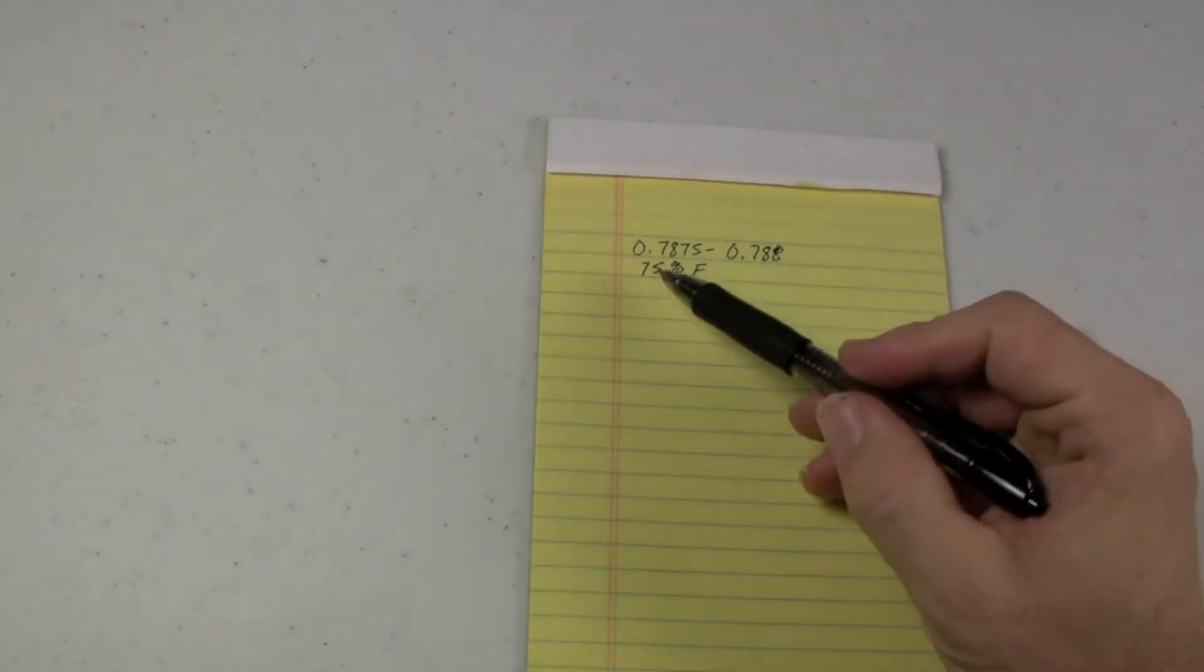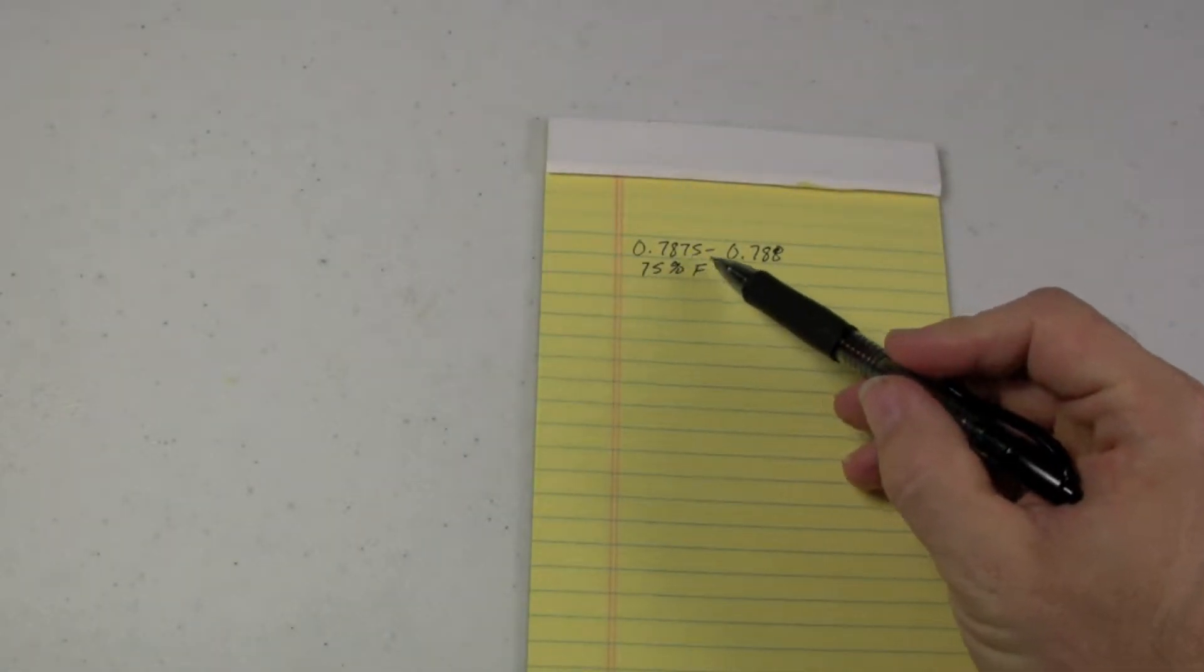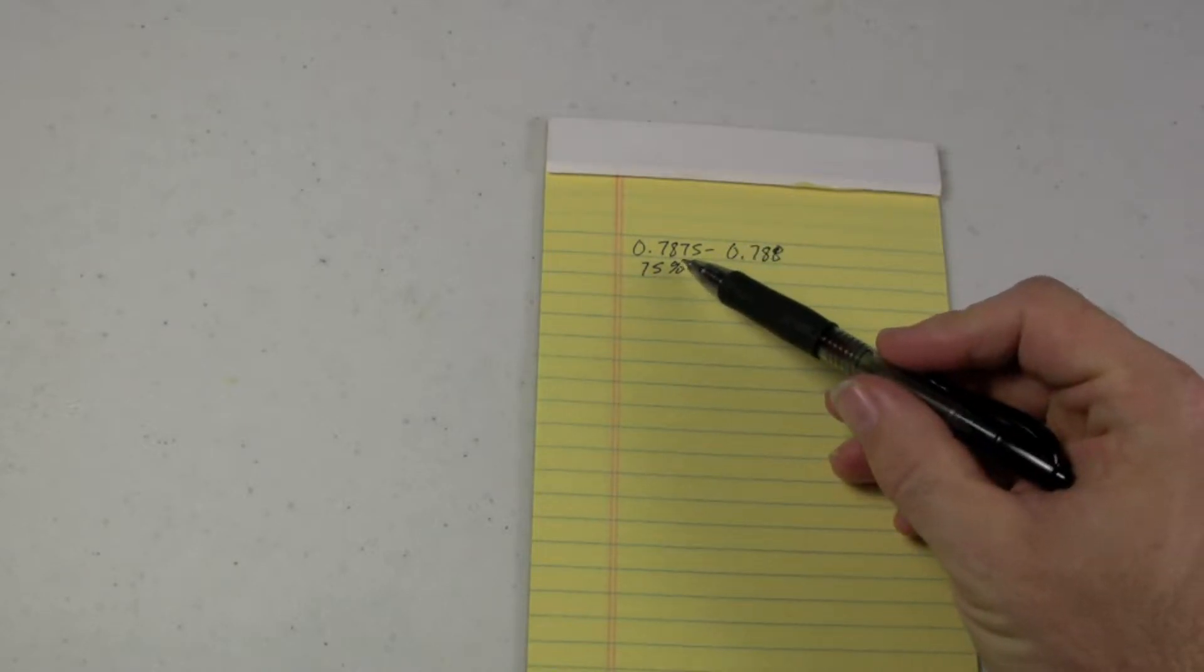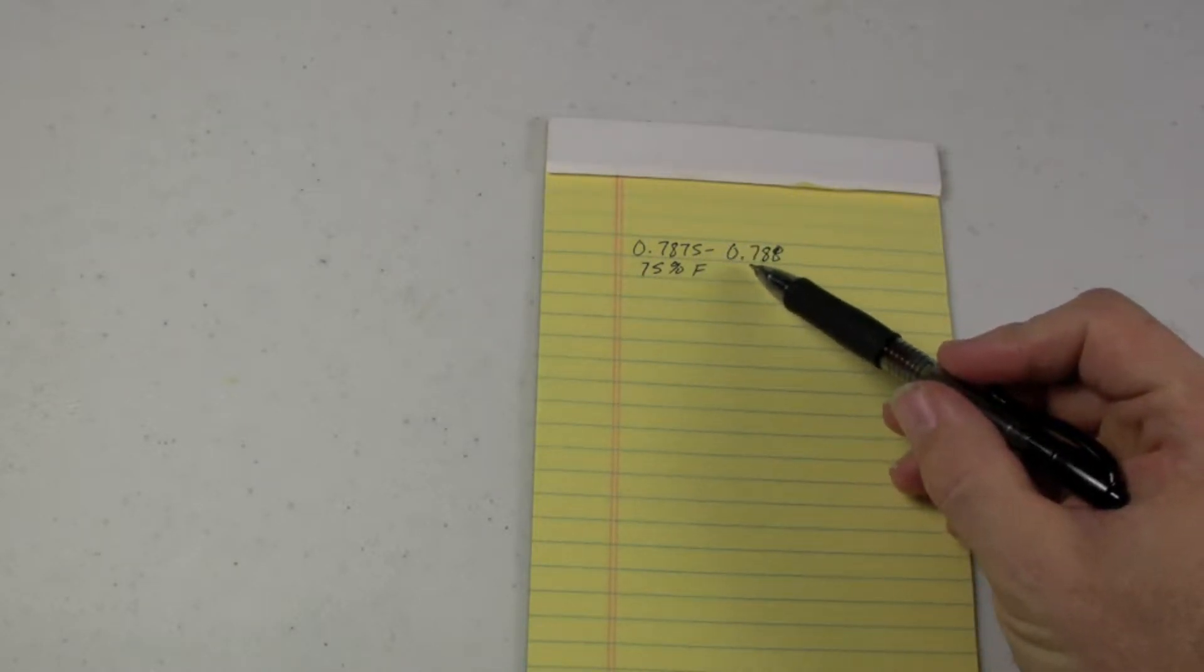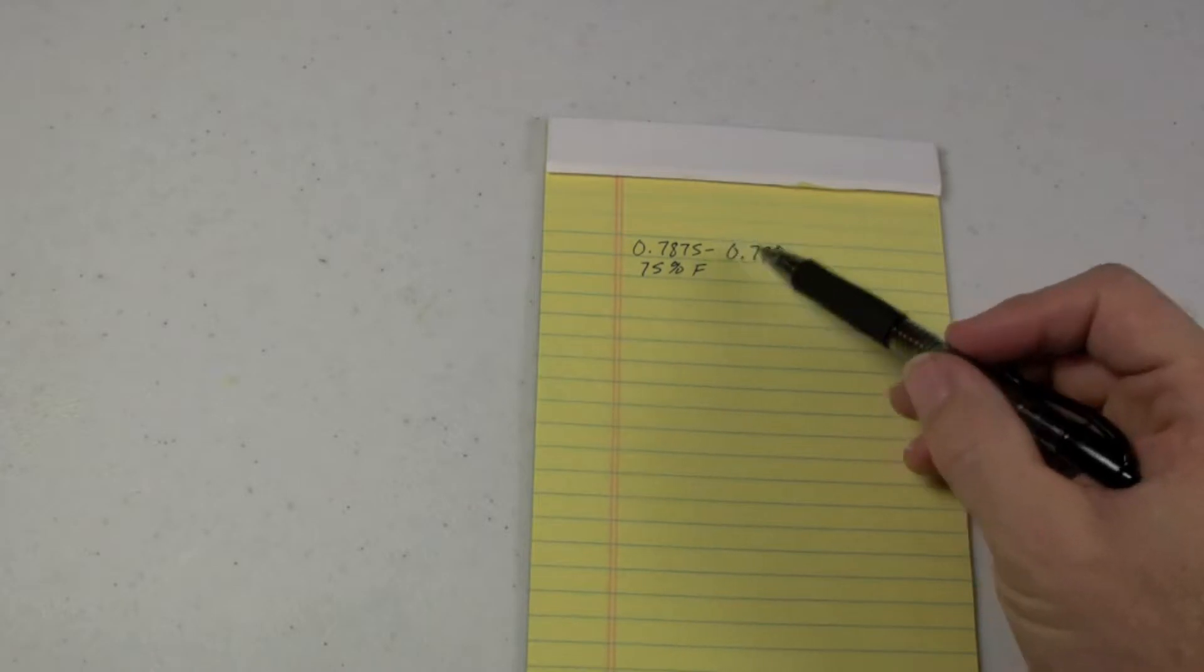When we took our reading, it was 75 degrees Fahrenheit. And the reading on the hydrometer was .7875 to .788. Somewhere in that range.